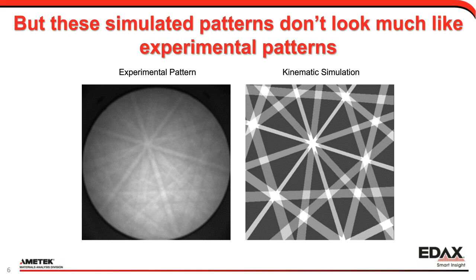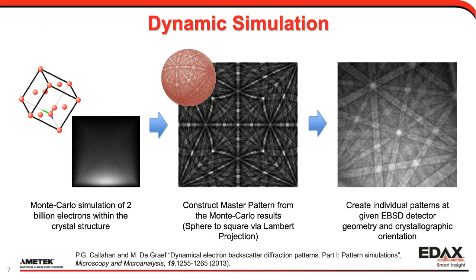So dynamic simulation, in this example here, I'm using Mark de Graef's code. And I should note that Mark de Graef has some of this available as open source codes that I'm using here. And what we're doing is adapting those ideas into OIM analysis to just make it more convenient.